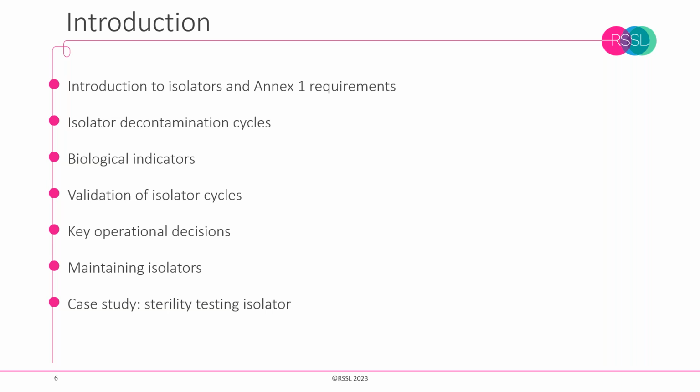There was a potential for isolators to be mandated for aseptic processing. There's still a wider range of options, but isolators are fundamentally key to reducing contamination control if they are maintained properly, and this is one of the things we'll have a look at.